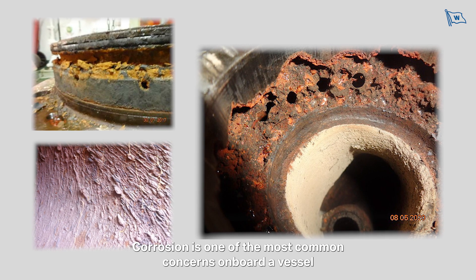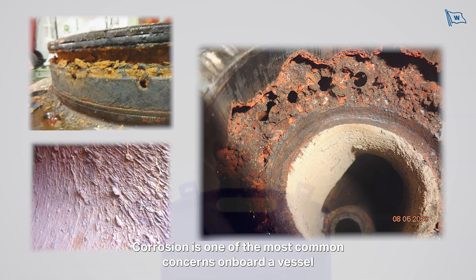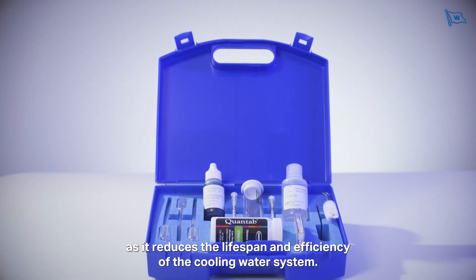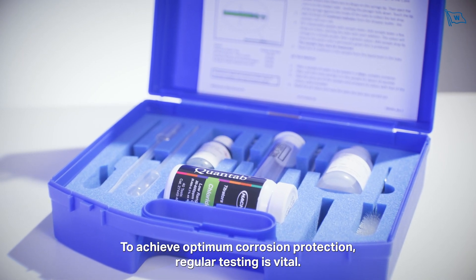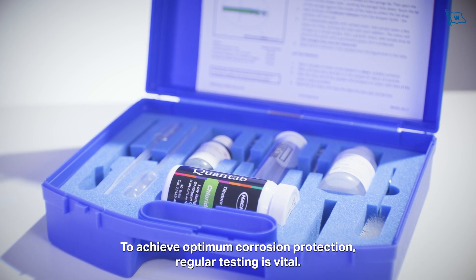Corrosion is one of the most common concerns on board a vessel, as it reduces the lifespan and efficiency of the cooling water system. To achieve optimum corrosion protection, regular testing is vital.